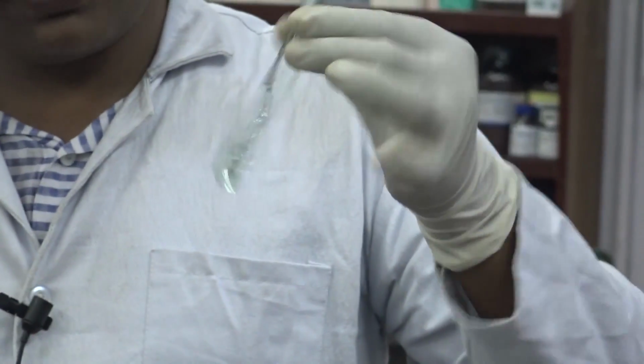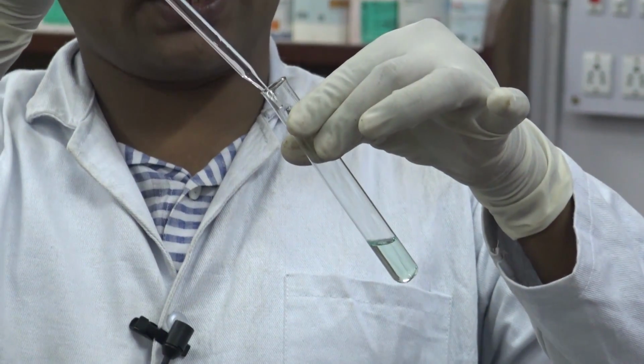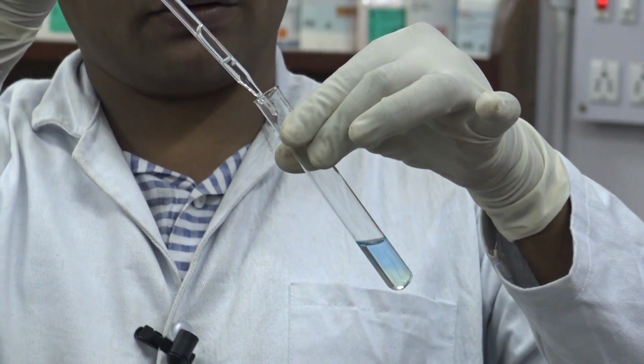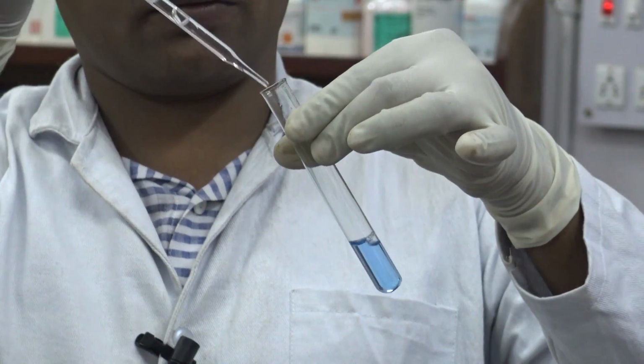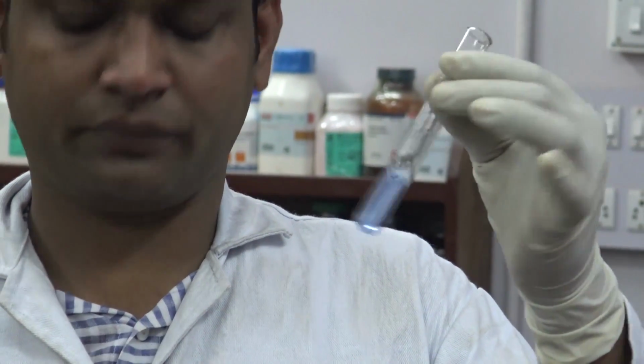After dissolving it in distilled water, make it alkaline using ammonium hydroxide. During alkalization, the color changes to blue.